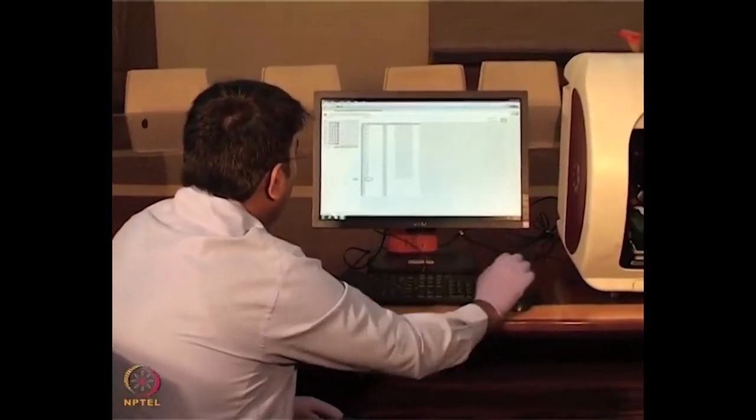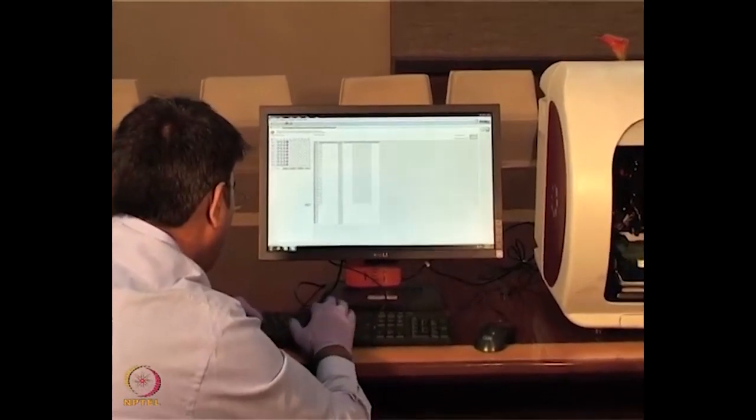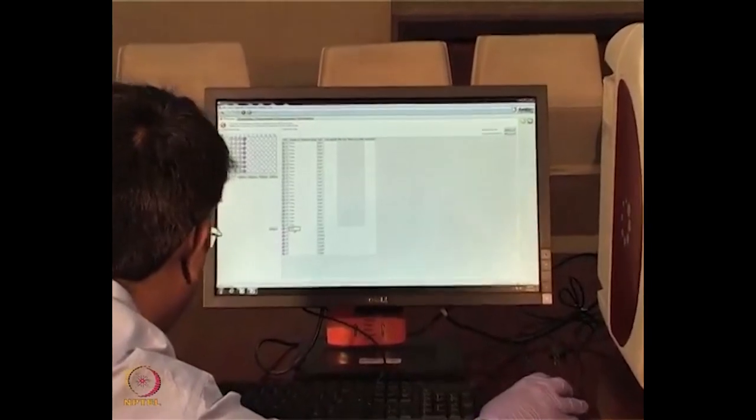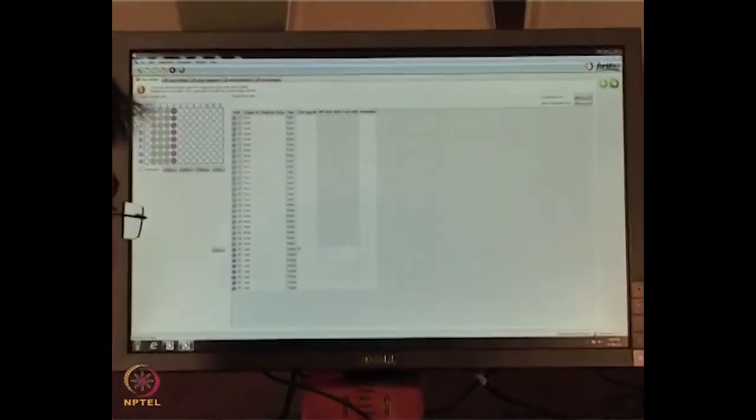Here I am mentioning the mouse monoclonal antibody. I will use mouse IgG. I am using 25 micrograms per ml, and the molecular weight of the mouse monoclonal antibody is 150 kilodalton. It automatically calculates 166.7 nanomolar. I will just copy this one.